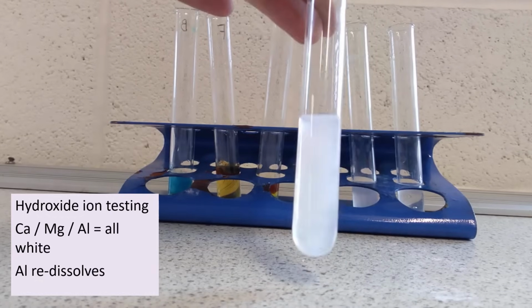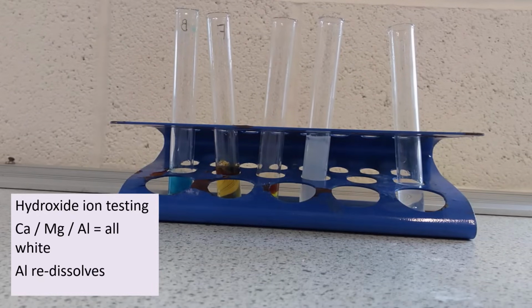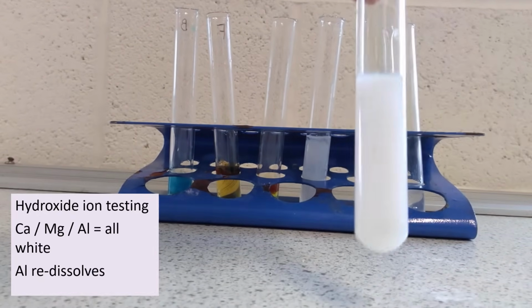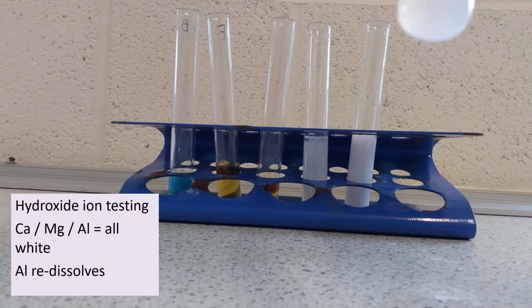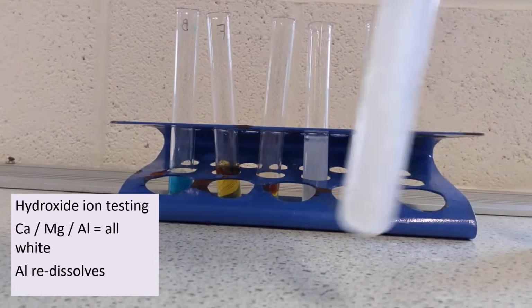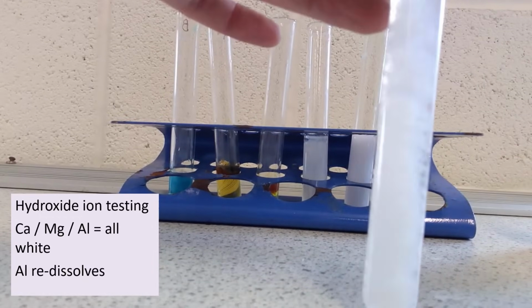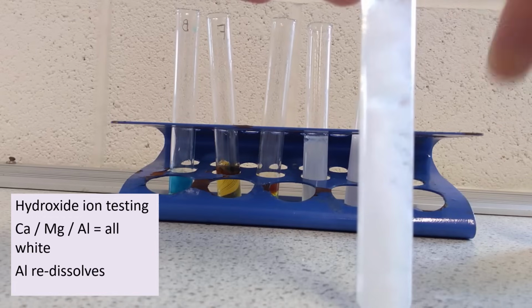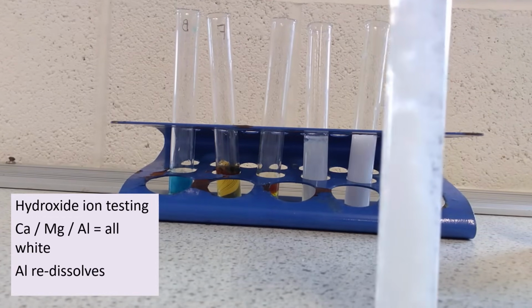So if I have a look at that, still very much precipitate. Still not really seeing any change. But with this last one, it's not very easy to see on the video, but around the sides we can see it starting to redissolve.